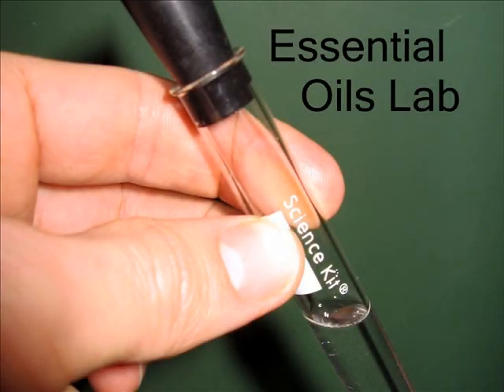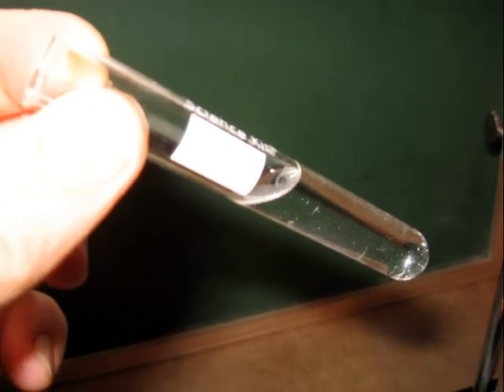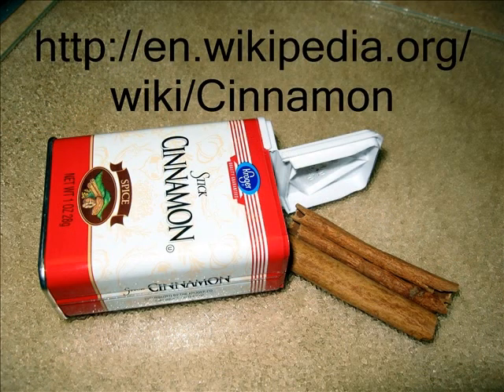This photo story describes a process students can use to extract essential oils to make potpourri or perfume. Essential oils are volatile, oily substances. They are the fragrance-causing chemicals found in many flowers, leaves, and barks.